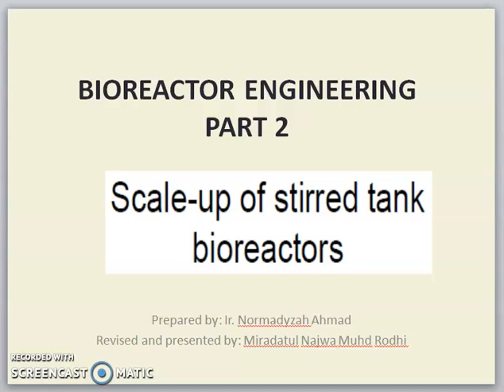Assalamualaikum. Hi. This presentation is on the second part of topic 5 on bioreactor engineering. In this presentation, we're going to look at the scaling up of a stirred tank bioreactor.